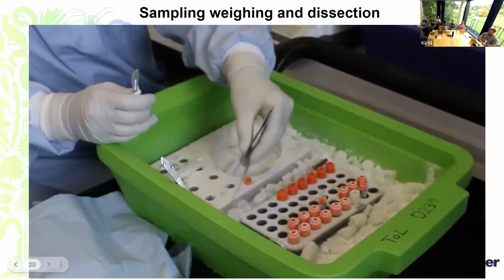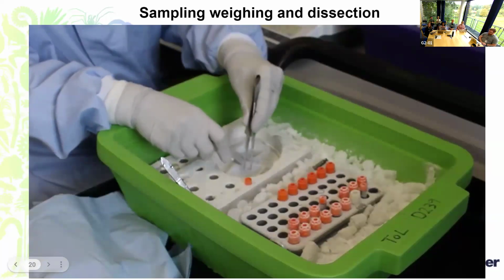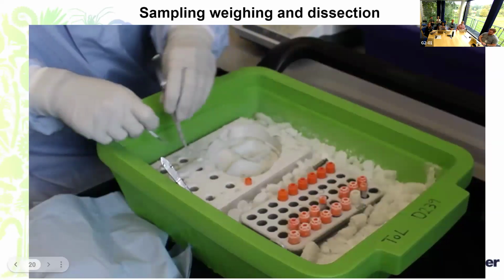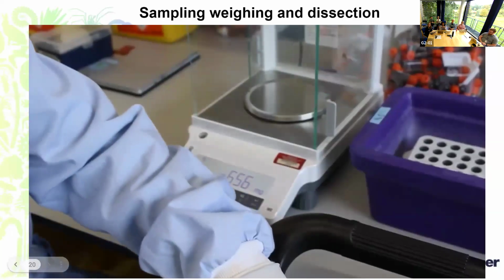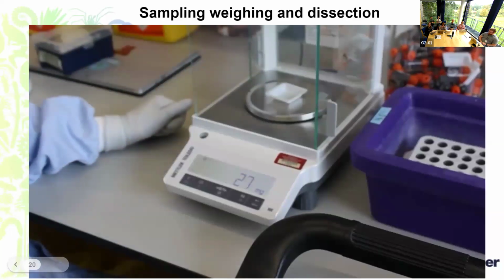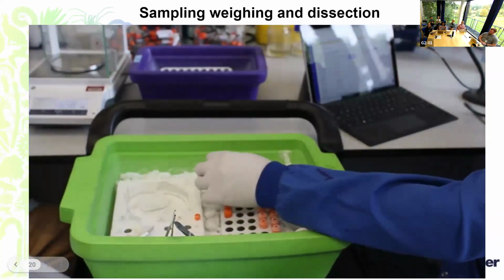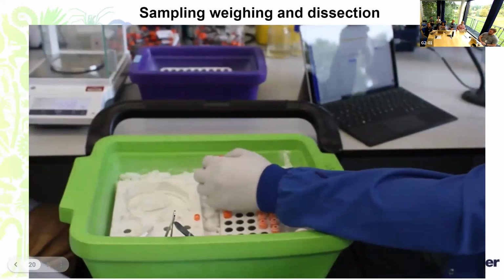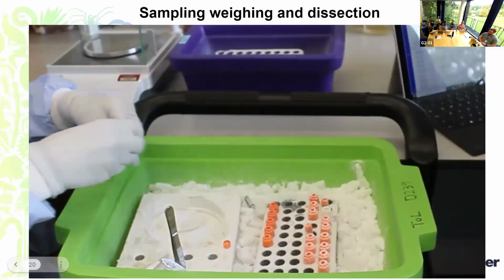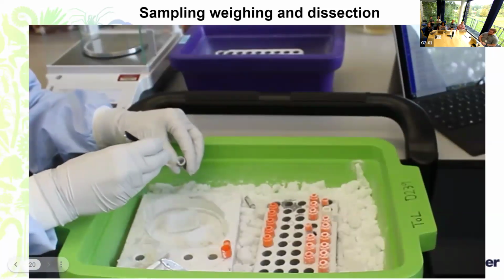So this sample is dissected for different processes based on the requirement. For instance, with arthropods, we prefer head sample for Hi-C and the thorax for DNA extraction. Once we have dissected and we are happy with the process, we take the sample, weigh it again, and make sure it is within the range. In the next few slides, you'll see how the weight range is optimized for different taxon groups. Once the sample dissection is done, the sample is transferred to a new FluidX tube and placed in an order so that it can be moved to the right storage box and picked up for the downstream processes.